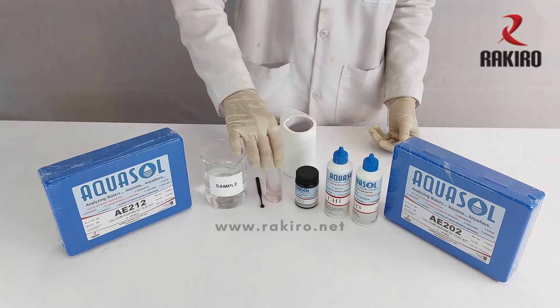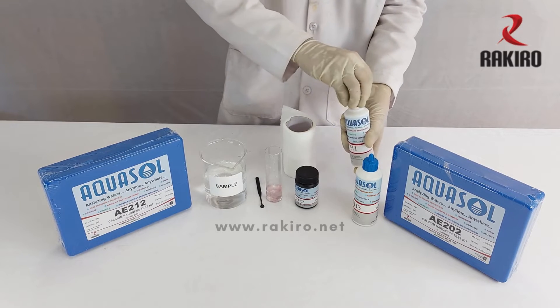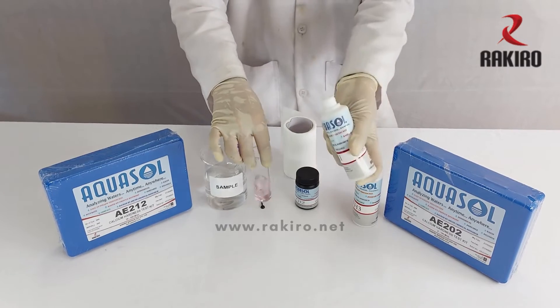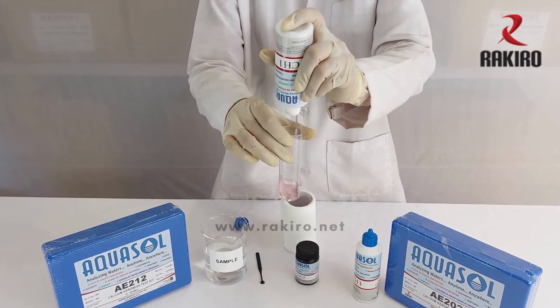Then add 10 drops of reagent CH1. Mix well.